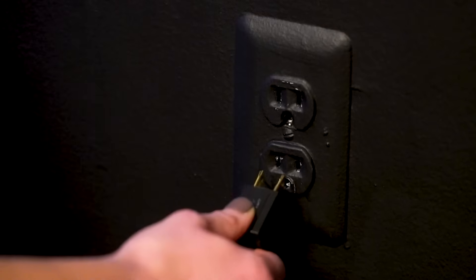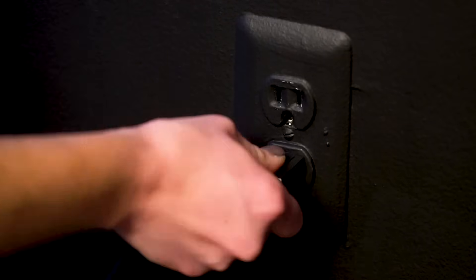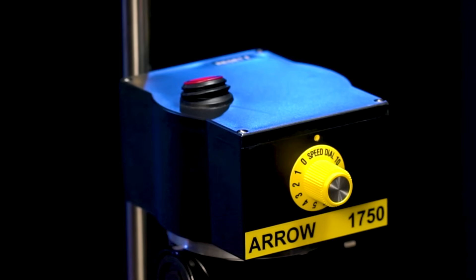Next, plug your stirrer into the outlet. Then, turn the switch into the on position. You should see the switch light come on.